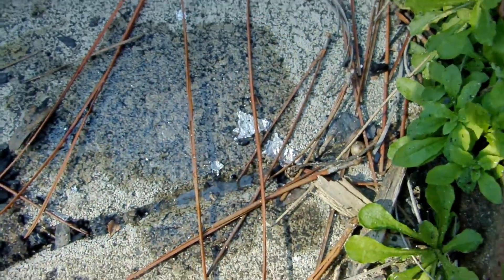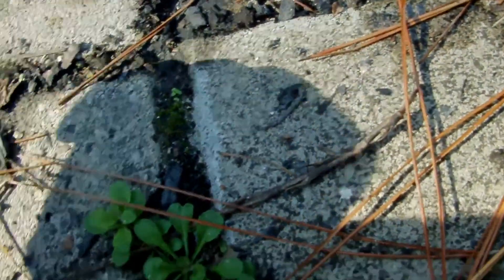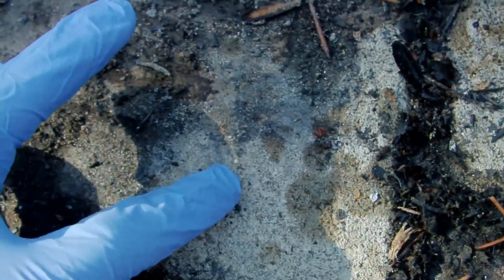This is really cool. After the reaction, it looks like there's splatters of aluminum all over the place in here. I guess that reaction was enough to make the aluminum molten, which is pretty amazing.